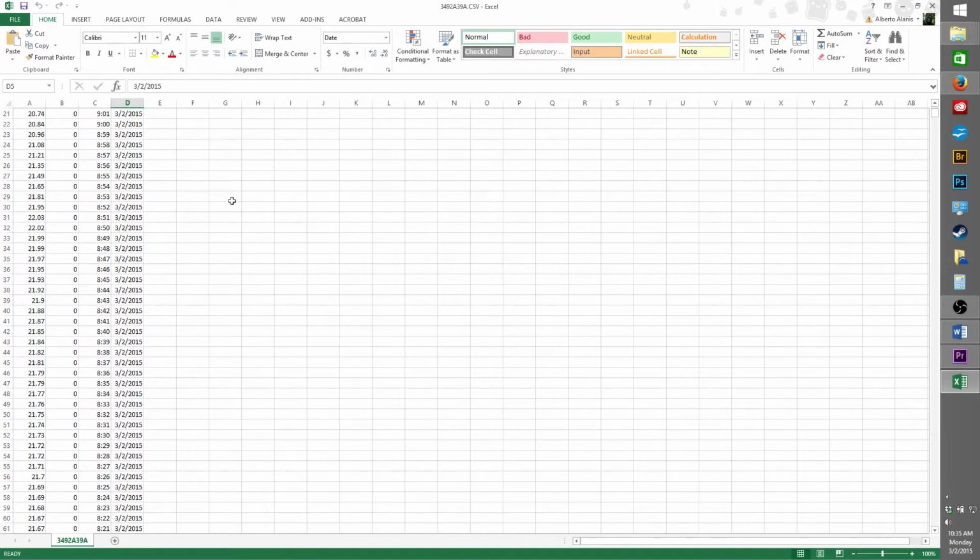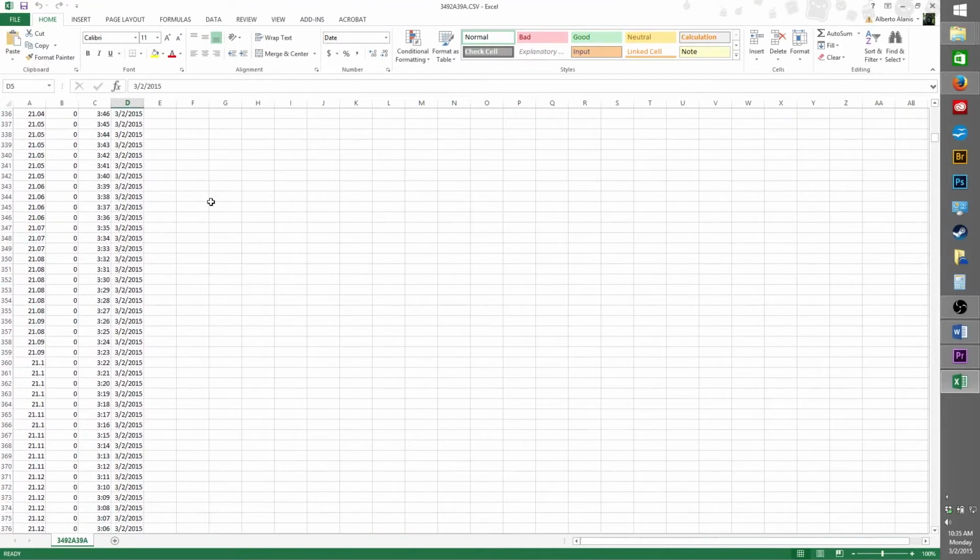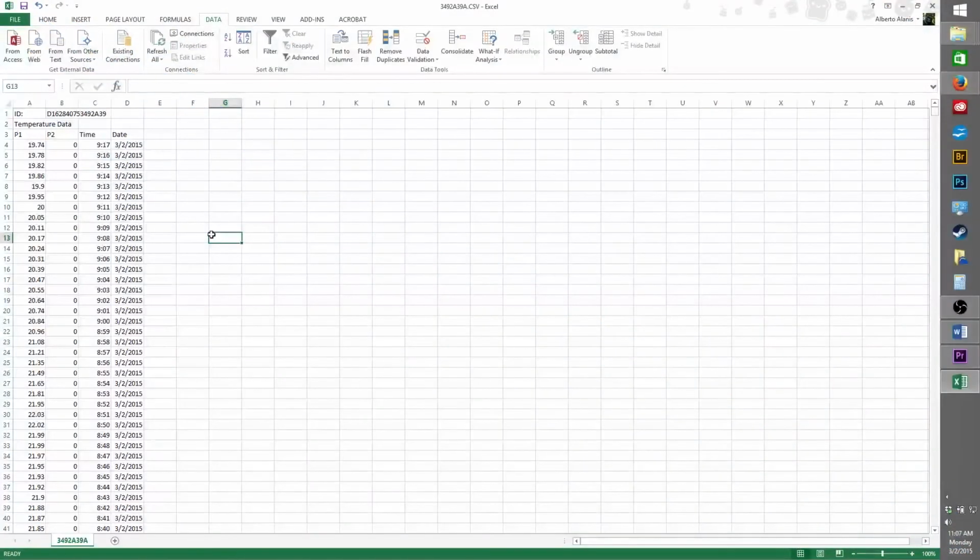As you begin to scroll down your spreadsheet, you may feel overwhelmed by the amount of data the Traceable Excursion-Trac can observe and record. Not to worry though, with Microsoft Excel we can apply filters to your columns so that you can only see the data you want to see. Let's go through 2 examples to get you reading your data efficiently as quickly as possible. First, let's start by filtering our spreadsheet to only show what happened on one day.